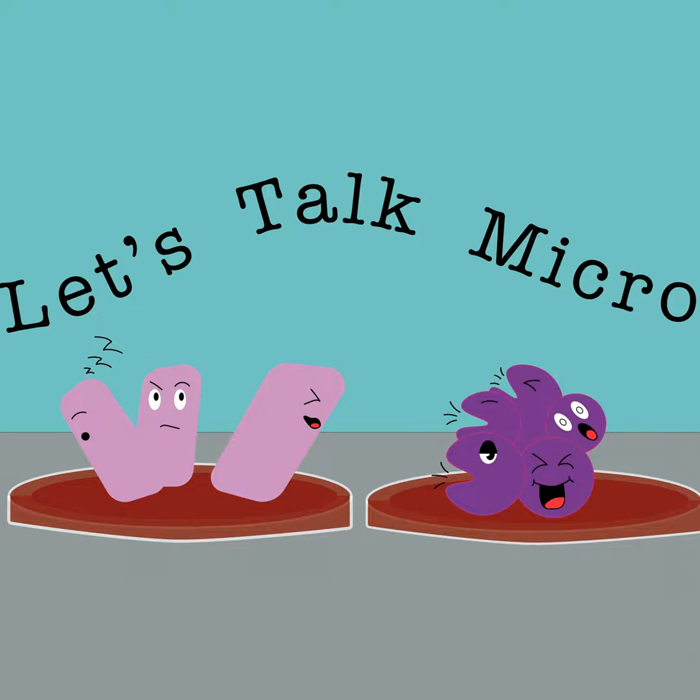So they would be looking at these things and taking pictures with their cell phones and uploading the pictures. What was nice about that is that in the lab in person, they tend to want the professor and other students to focus for them. But at home, they had no choice. They had to focus themselves. So they really had to learn how to use the microscope. And they enjoyed the experience.